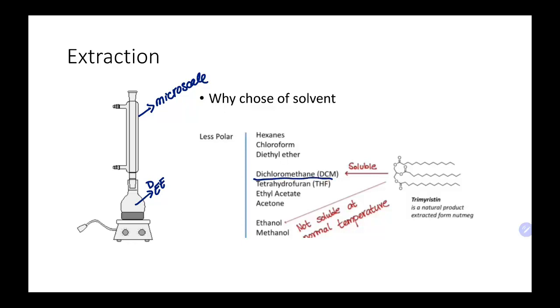Commonly, dichloromethane is what's used. One of the things chemists will sometimes do to implement green chemistry is to look at what are common substitutes for dichloromethane. Ethyl acetate is a potential one. So if you were to try to do this experiment, let's say again, you could try ethyl acetate to see if that would work.